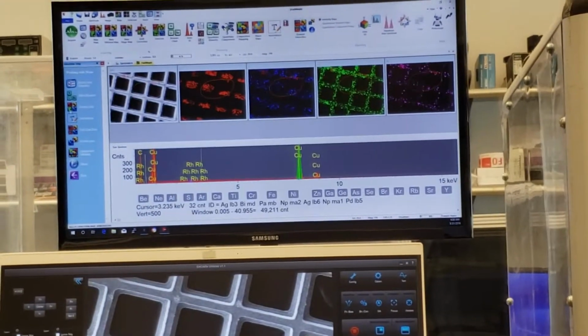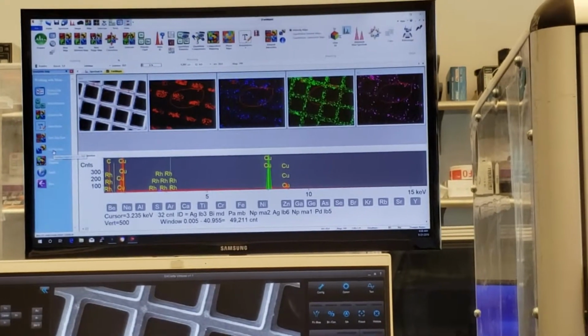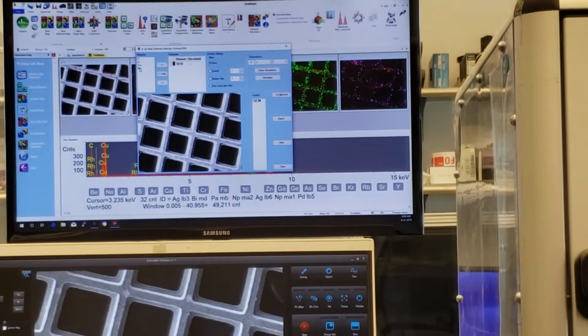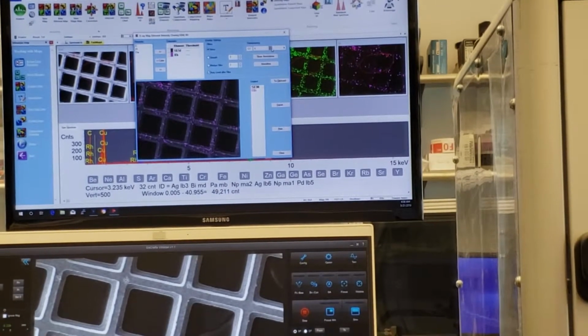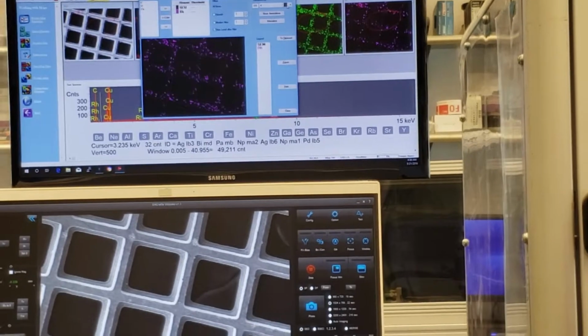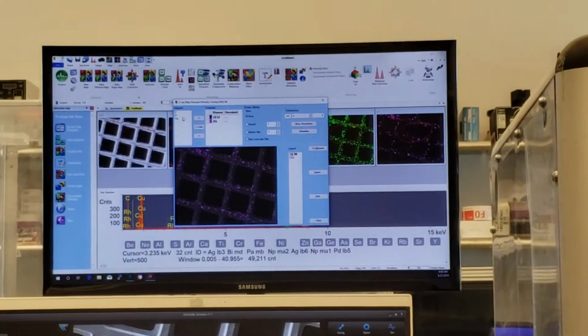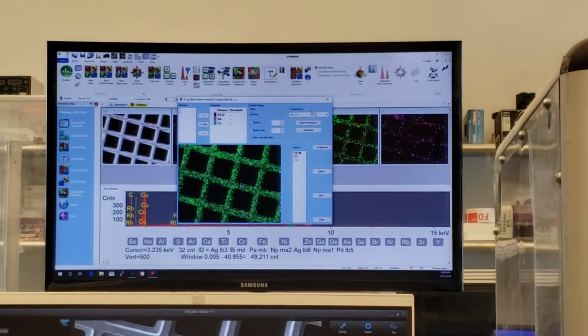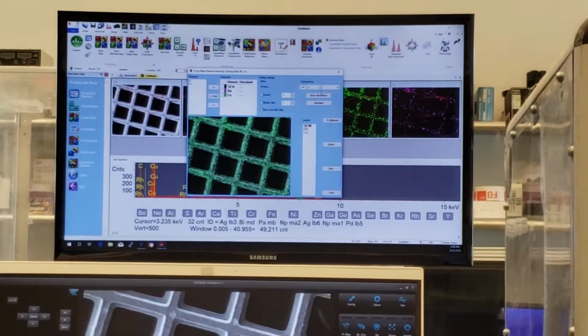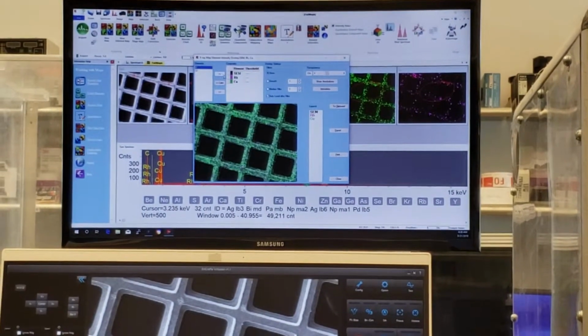And then also, flow charting this down, I can go overlay. So if I go overlay, let's throw the SEM image up. Great. Show me where the rhodium sits. Great. Change the intensity levels. Show me where the copper is. Great. Change the intensity levels. And you're overlaying all the elements on top of each other. You know, throw the carbon in there too for that matter.